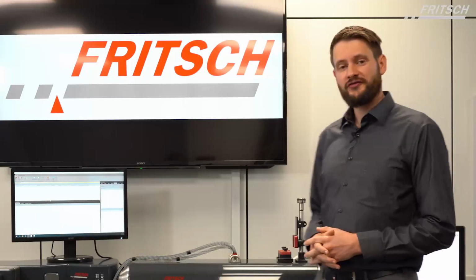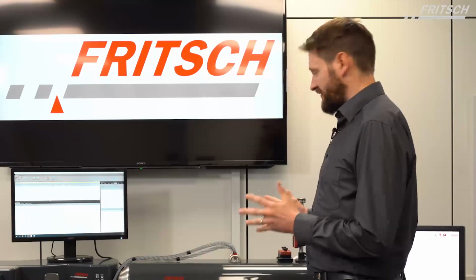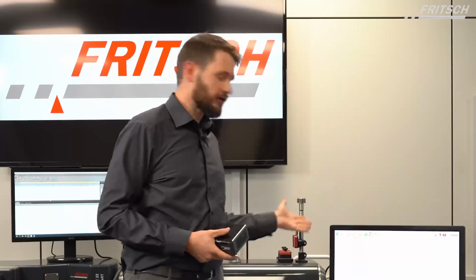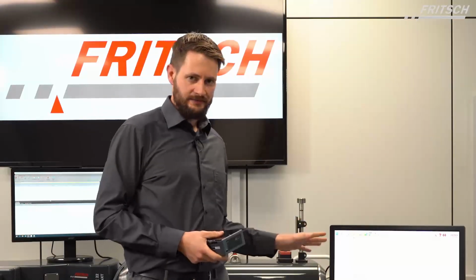This way, both instruments will be delivered including an own computer. In this case here, we have taken out the computer of the A22, installed the software on the computer of the A28 and are running both programs from one PC.